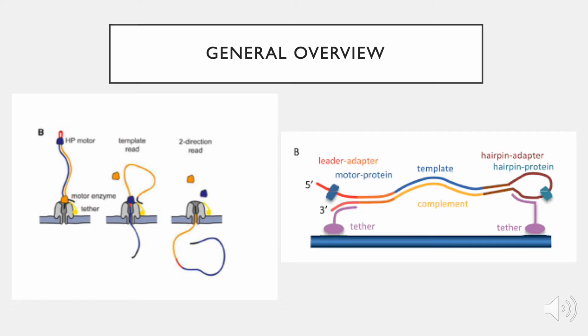Once the DNA or RNA is tethered, sequencing starts on the template strand at the 5' end of the Y adapter. As the Y adapter approaches the nanopore, the enzyme motor unwinds the double-stranded DNA so that a single strand is pulled through the nanopore at a time.